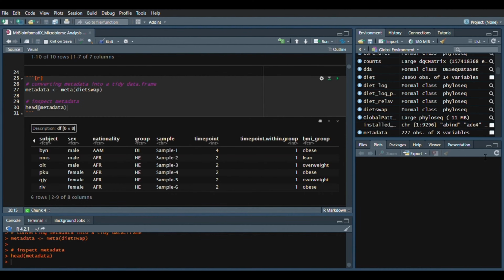And secondly, to correct the analysis. If we leave them as plain numbers, R might treat them as continuous data, which would be incorrect. This could lead to wrong conclusions when we analyze our data, because R might try to perform mathematical operations on them, like finding averages, for example, which doesn't make sense for categories. And lastly, for visualization. When we plot the data or create graphs, specifying these variables as factors allows us to categorize the data correctly. So, let's correct our data types.